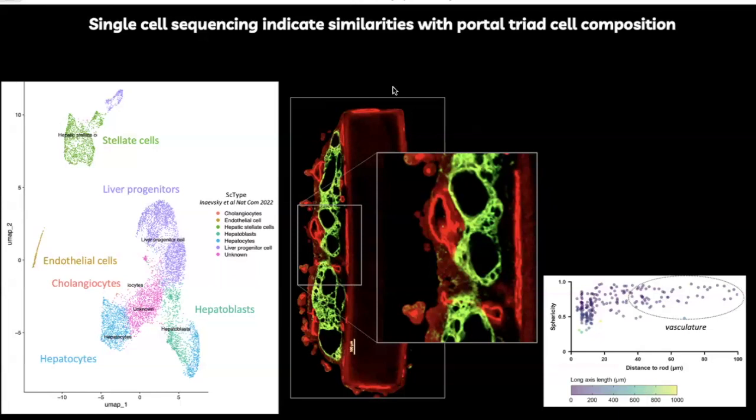So we think that this sort of system can be a first step in trying to reconstitute more of the liver lobule. I really insist that to obtain this, there was no added culture medium, there was no added extracellular matrix. It's pure self-organization coming from grafted growth factors on the surface of the rod and seeding of hepatoblasts on that surface. The rest is just a maintaining medium where cells would grow and migrate.